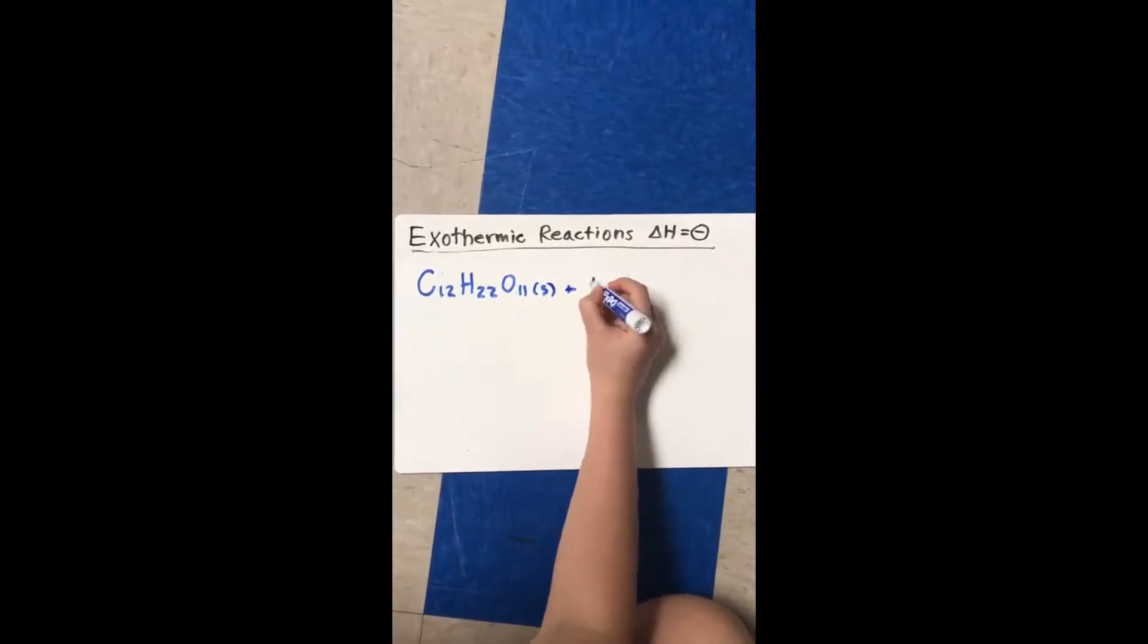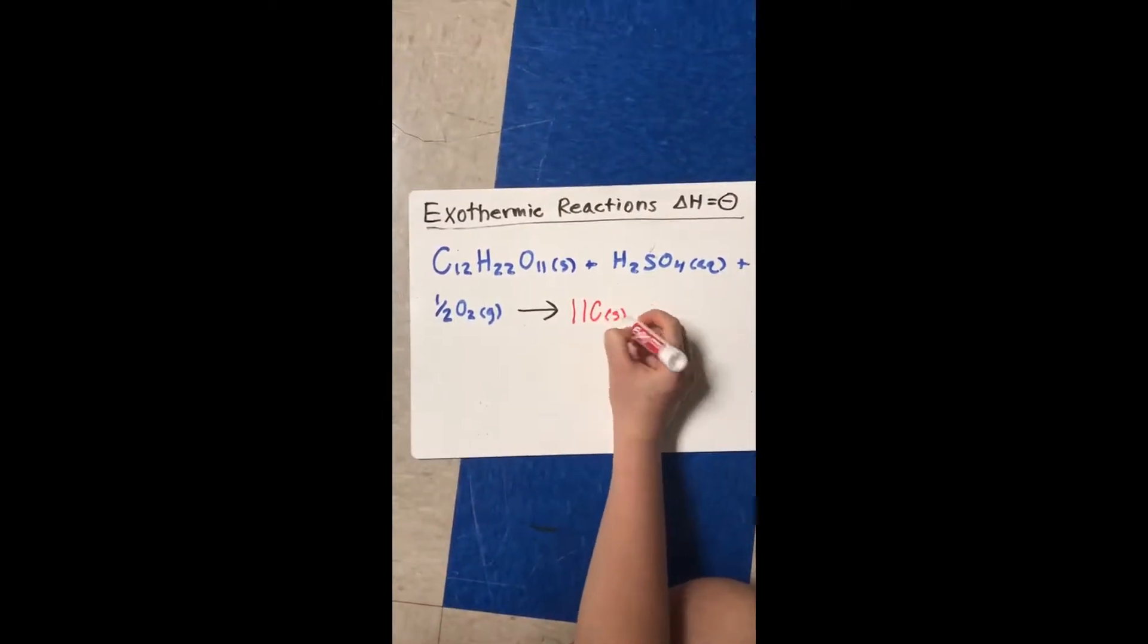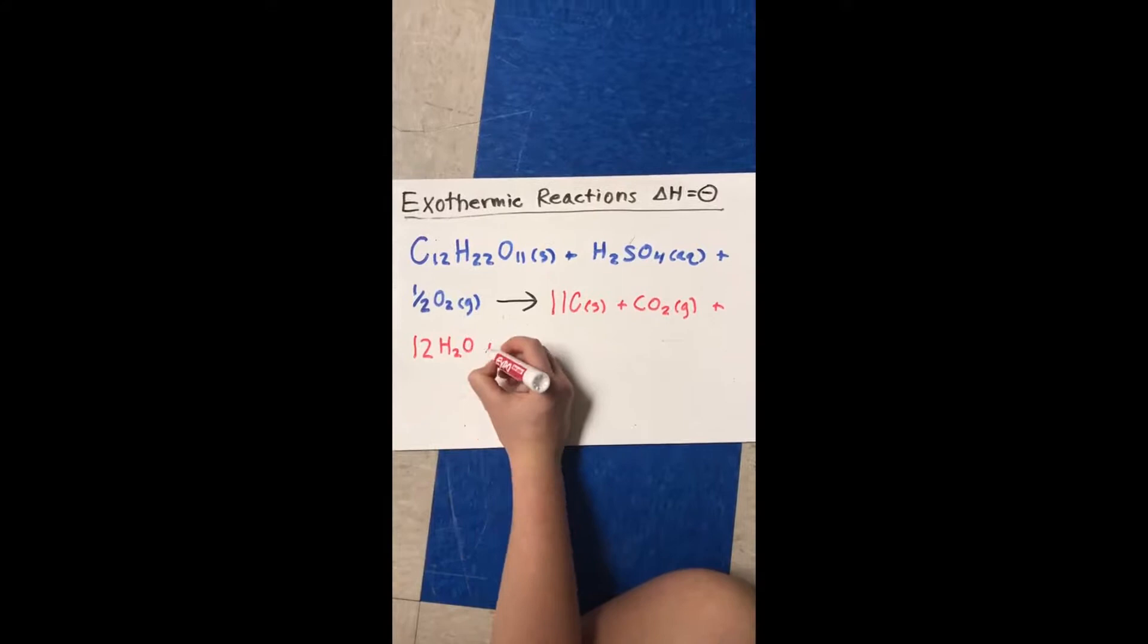In this experiment, we are going to mix sugar with sulfuric acid and oxygen that's in the air to produce carbon, carbon dioxide, water, sulfur dioxide, and heat.